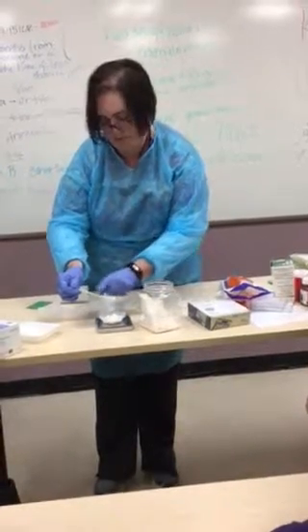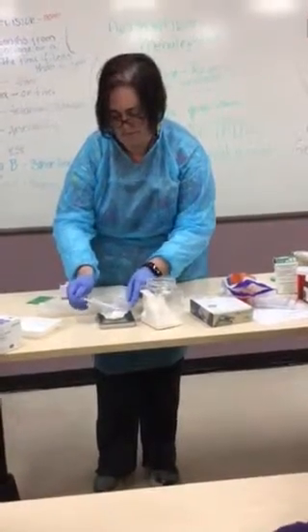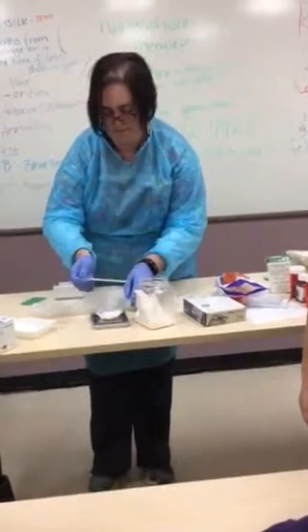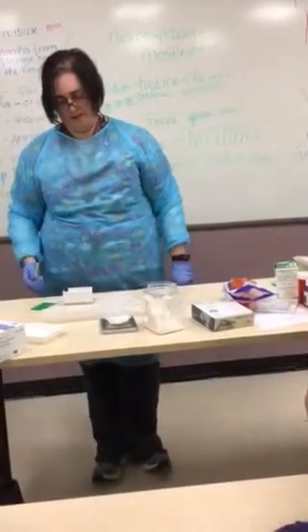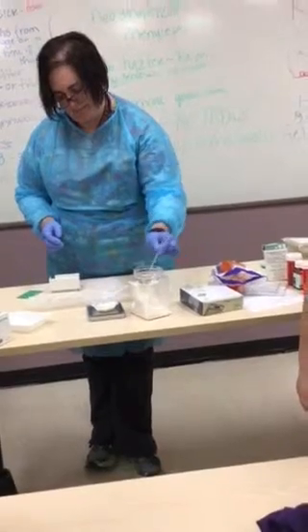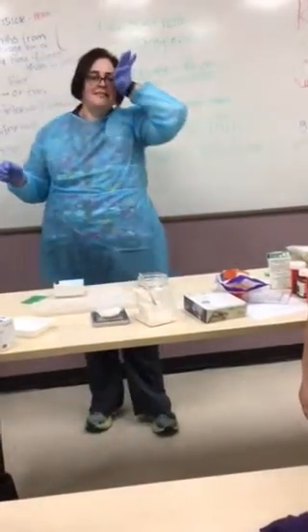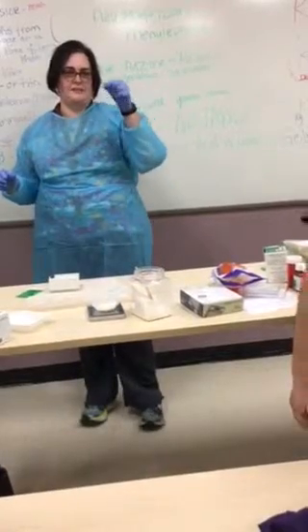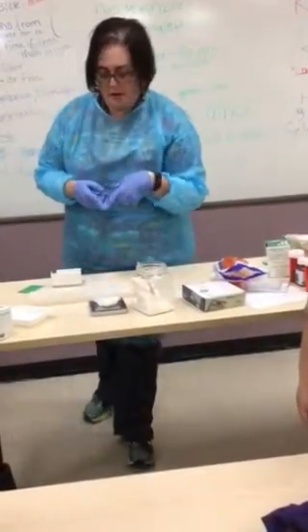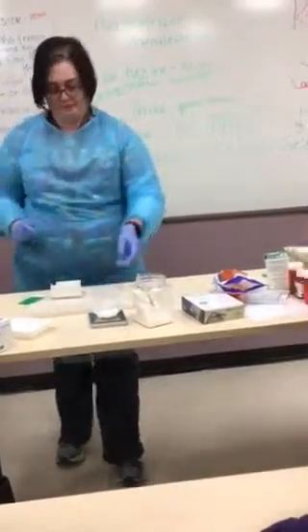So this is the second most time-consuming. I need to find the little spoons I have. I have little tiny spoons that are shaped like that, that are much easier to use. So I'm at 13.8, even though it's bouncing back and forth. We're going with 13.8, so if you would write that down — it's going to come into play.